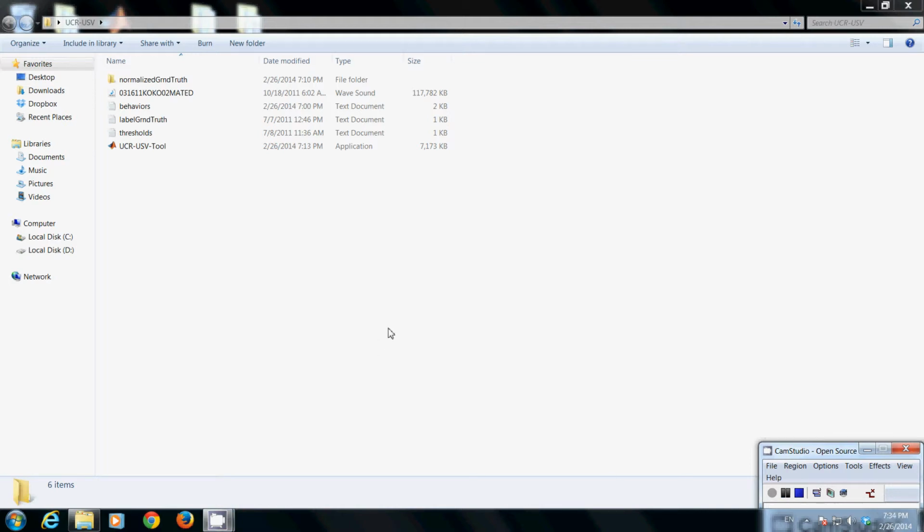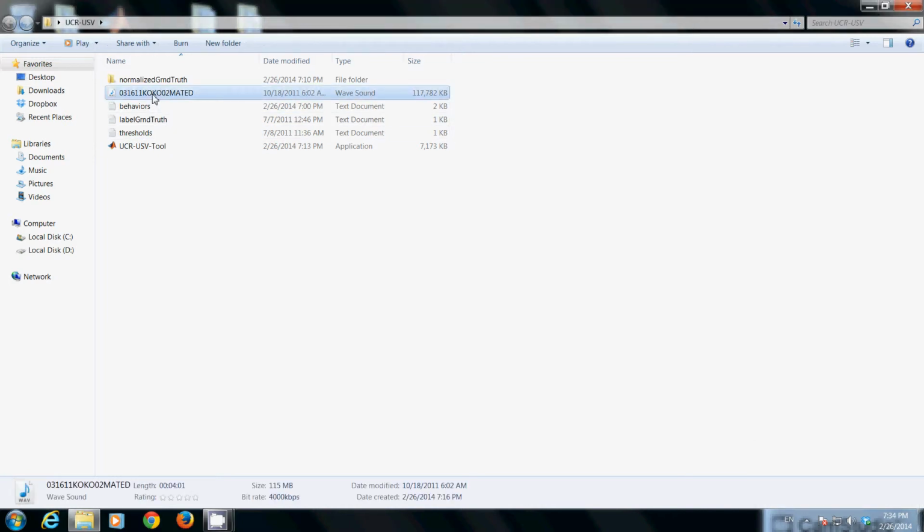Hello, this video is a short tutorial on the UCR USV tool. This folder is the exact folder that I have provided in the email, except this WAV file, this audio file. This one is a short recording of mice vocalization that was recorded by the neuroscience department, and I'm going to provide a separate link so you can download this as the sample WAV file that we will be testing in this tutorial. But all the other files are in the UCR USV folder.